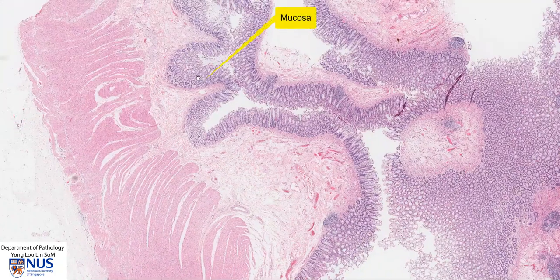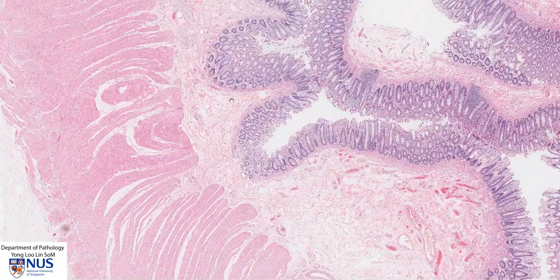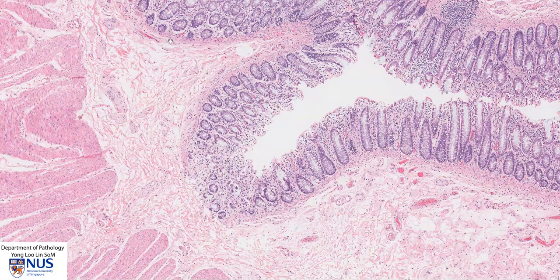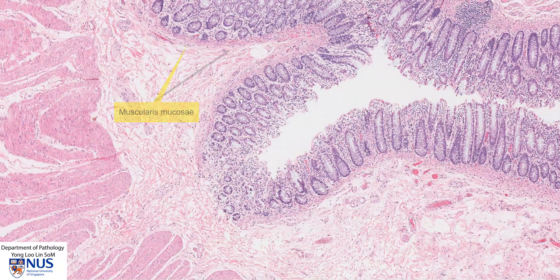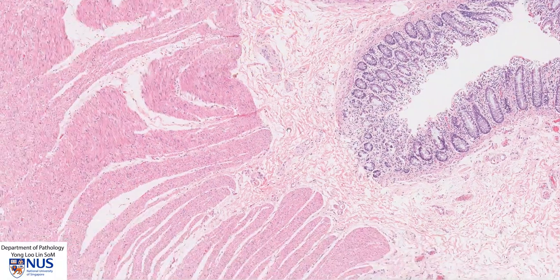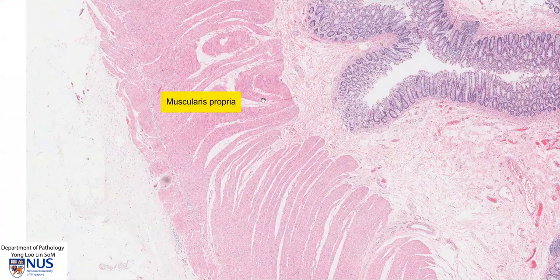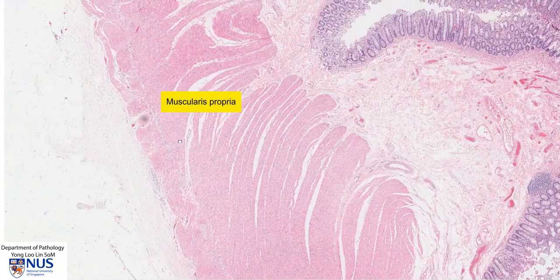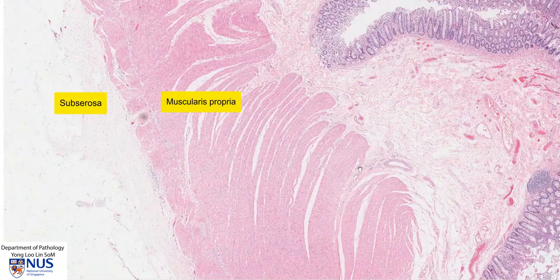This is the mucosa. Just below this is a very thin layer of smooth muscle known as the muscularis mucosae. And then we have the submucosa, which is composed of loose connective tissue. And then we have the muscularis propria, the thick muscle coating, and the subserosal tissue.